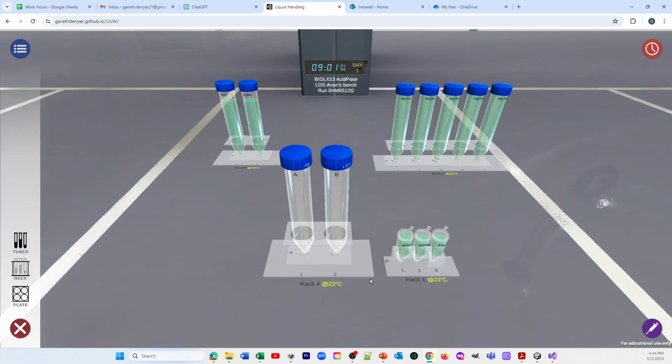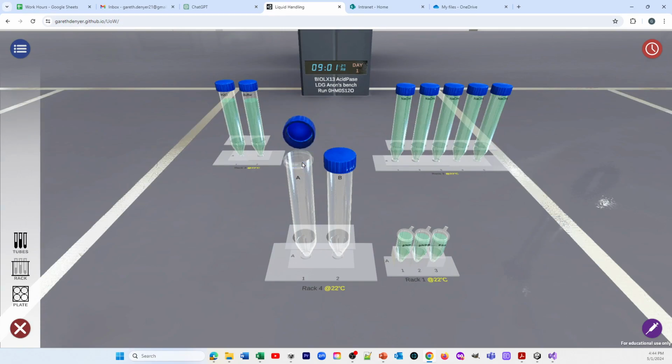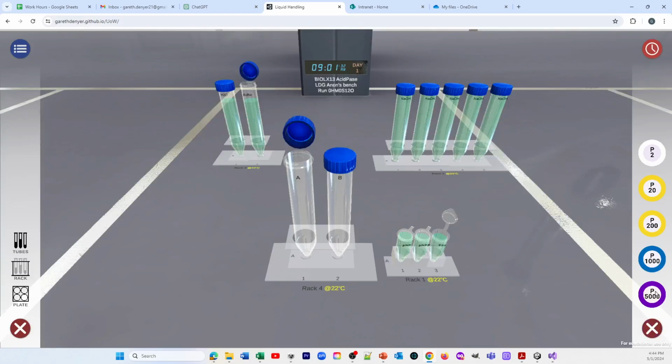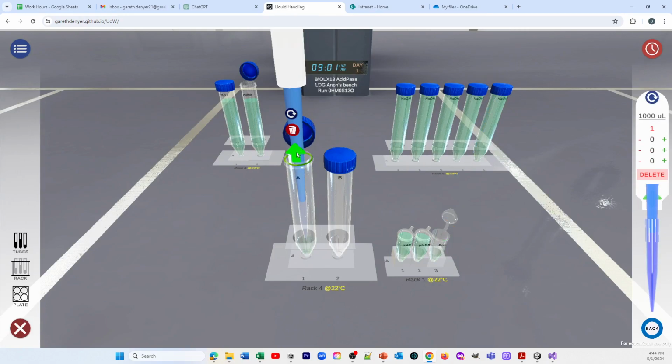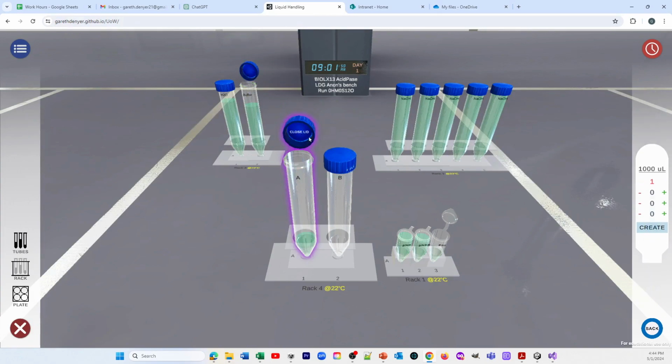And then I'm going to take 1 mil of the enzyme and I'm going to dilute it with a mil of buffer. So let's take 1 mil of enzyme and suck that up. And I might just refresh the pipette tip and put a mil of buffer in. And having done that, I'm going to mix because I think it's a really good idea just to get the mixing done, get it out of the way. Close the lids of the things that you don't want.